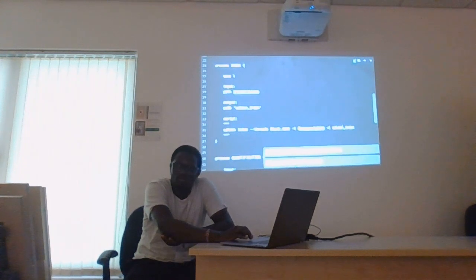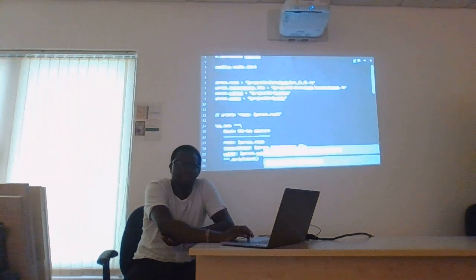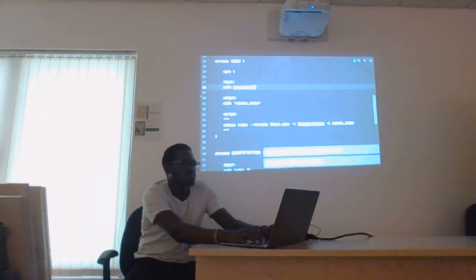Rather than writing transcriptome as the input, which I feel is redundant since we've also declared what our input is in the input section, down here, the input data. So this name does not have any significance. You can change it to anything. Yes, I understand that.